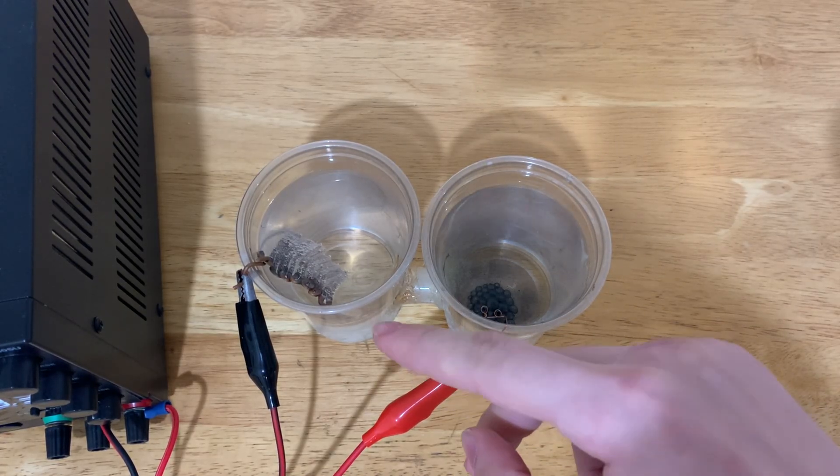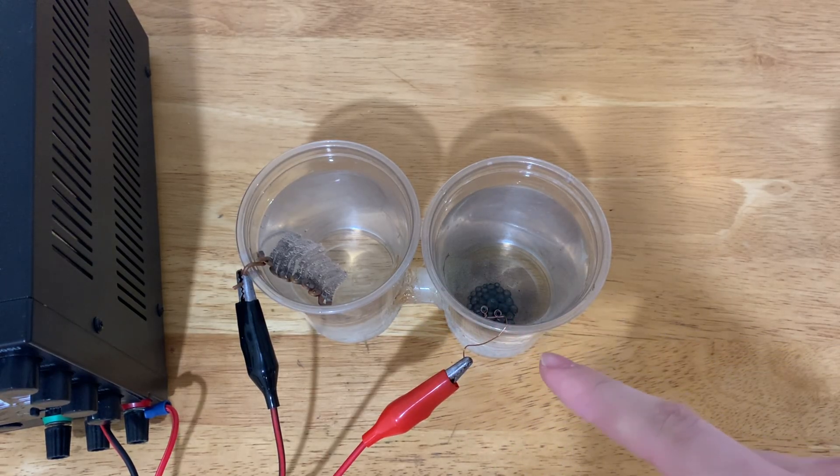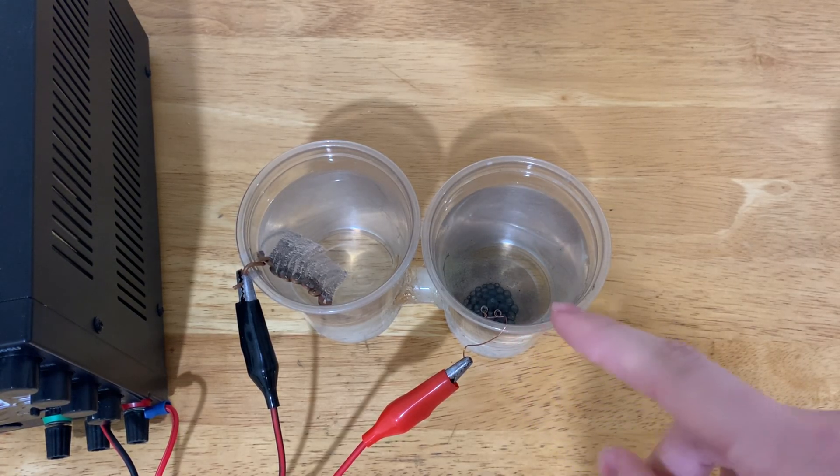Any sulfate ions which get dragged over to the anode actually try to take a bite out of the graphite electrode. But the graphite electrode is incredibly corrosion resistant, so they fail, and the sulfate ions actually get reabsorbed back into the water instead.